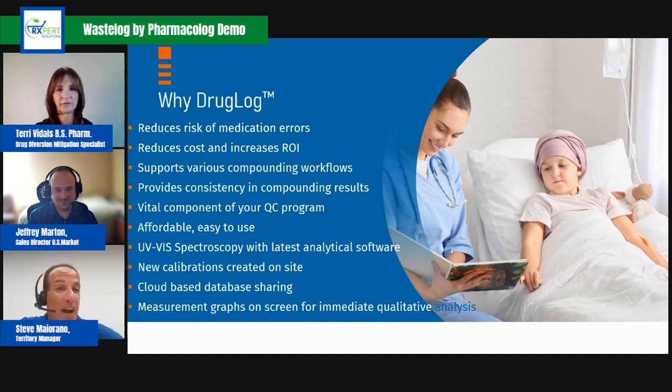There are a lot of products out on the market that are great quality assurance tools that use gravimetrics and photographs, but they truly will not give you exactly what is in that compound. So primarily, it's going to reduce medication errors before the medication actually leaves the pharmacy. It's going to reduce cost and increase ROI.